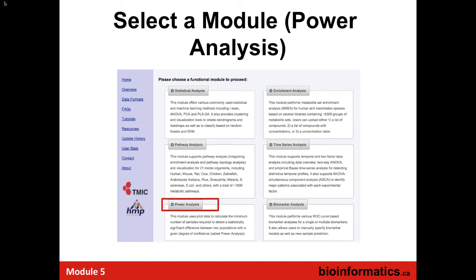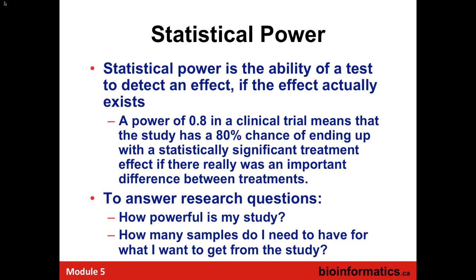Another technique that's often used and often asked, especially for people writing grants but also trying to design experiments, is called power analysis. This is common in medical grants. It's also common in veterinary practices where they have to determine how many samples do we have to collect and at what point will we say our study is too small or too big or just the right size.